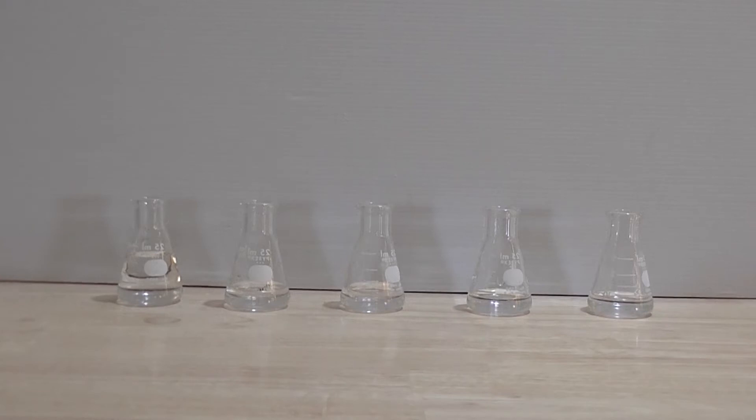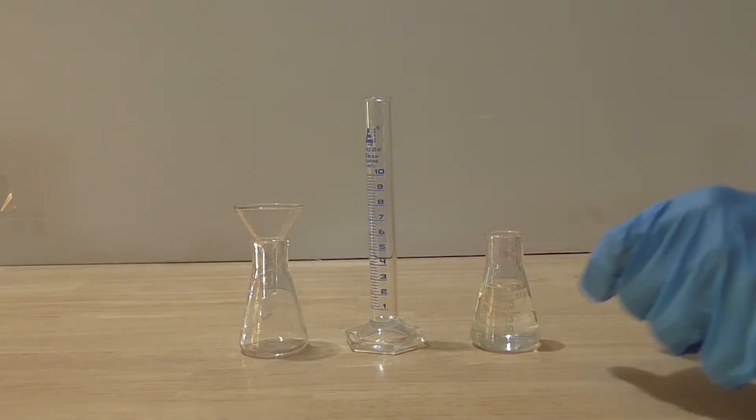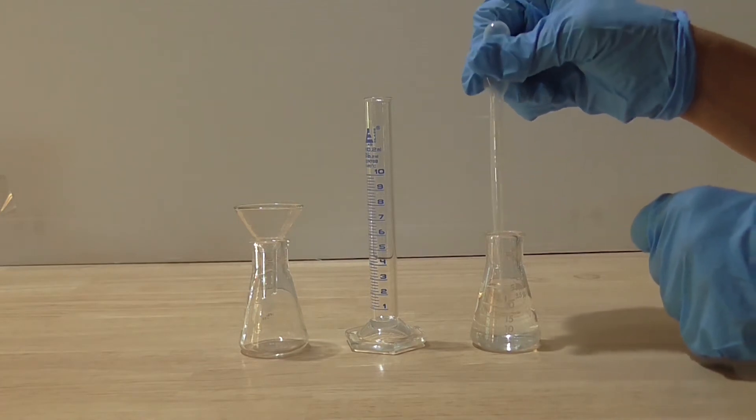I hope this procedure becomes clearer as you watch the rest of the video. So, let's get started. I start with my 1 molar stock solution of hydrochloric acid. Remember that in this experiment, the standard volume is always 1 ml. I pipette in 1 ml of the 1 molar hydrochloric acid into the measuring cylinder.